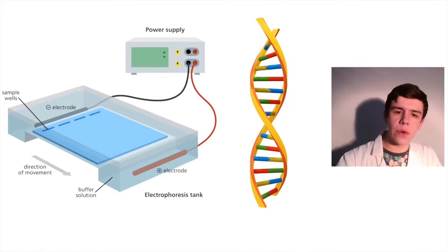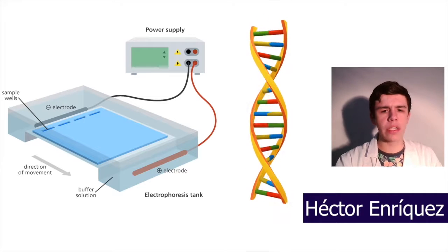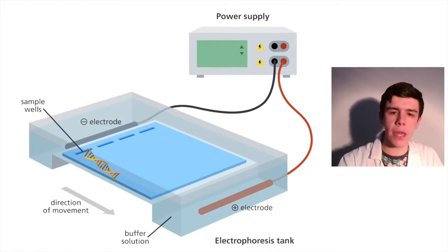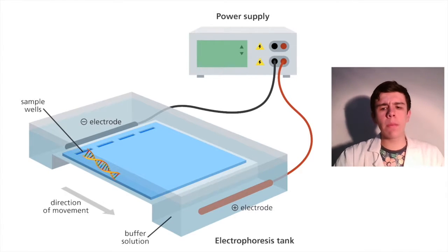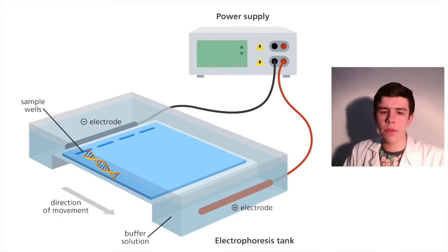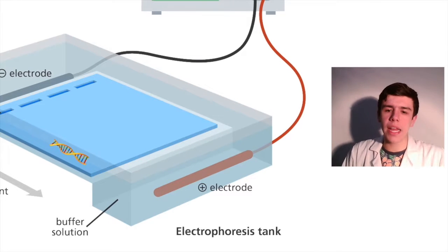Electrophoresis is a term that refers to the migration of charged molecules within a gel matrix. During this dispersion, nucleic acid fragments are separated depending on their size, shape, and charge, due to the density and porosity of the gel. This movement is powered by an electrical current that takes advantage of the negatively charged molecules of the genetic material. This technique has provided a variety of molecular analyses useful for different applications.